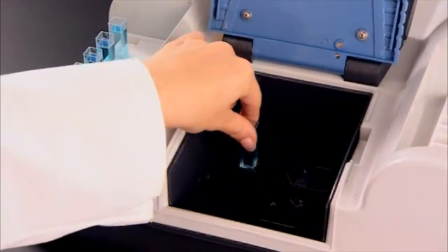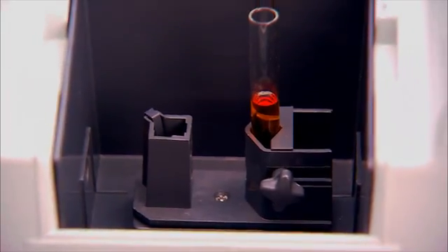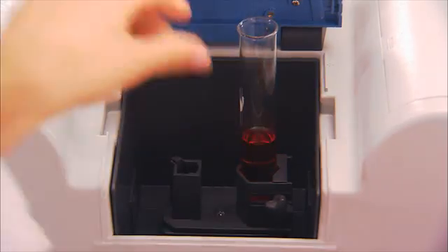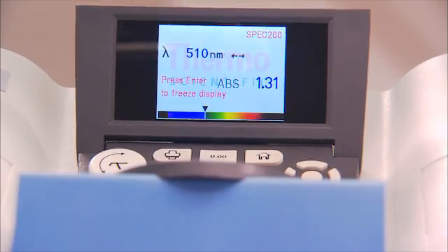The larger, more accommodating sample compartment accepts cuvettes and test tubes of varying sizes — no adapter necessary. Even tall test tubes aren't a problem because the SPEC 200 is room light-resistant. It can measure accurately with the lid open.